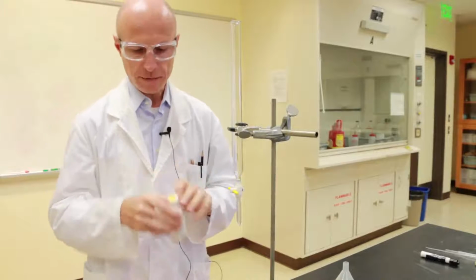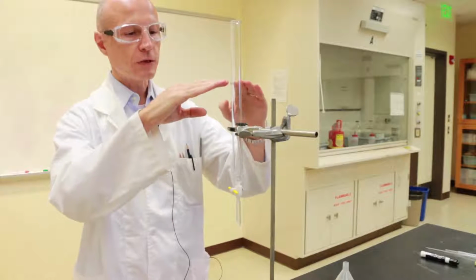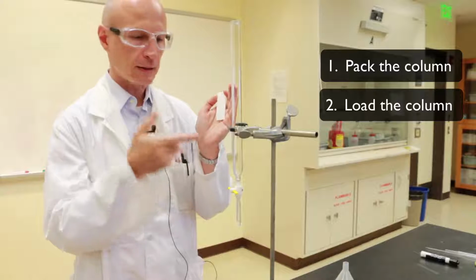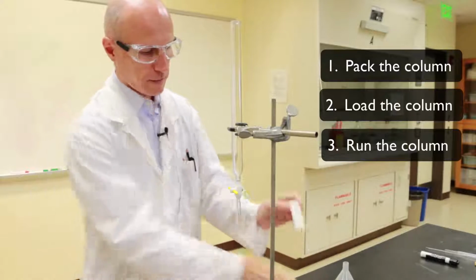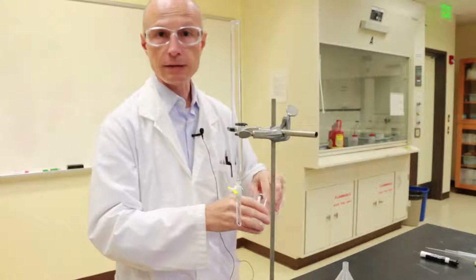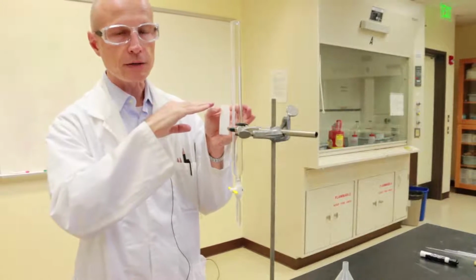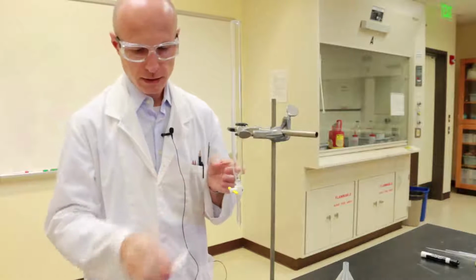Column chromatography is a very touchy technique. There are three phases in column chromatography. First, you pack the column, that is, you prepare it for your experiment. Then you load it, which is the equivalent of spotting the TLC plate, that is, you put your compound on the silica gel, and then you run it, which is the equivalent of putting your TLC plate in the TLC chamber and running it up. The only difference between TLC and the column chromatography is that in TLC your solvent goes up by capillary action. In column chromatography your solvent goes down by gravity, but that's the only difference.